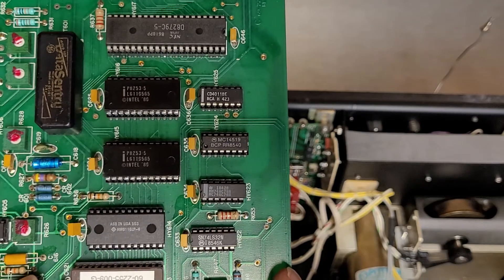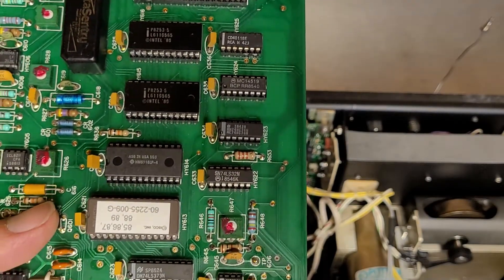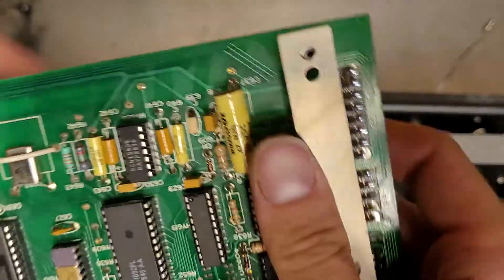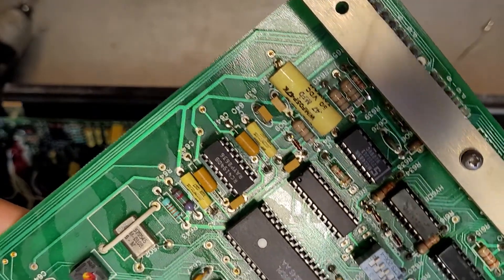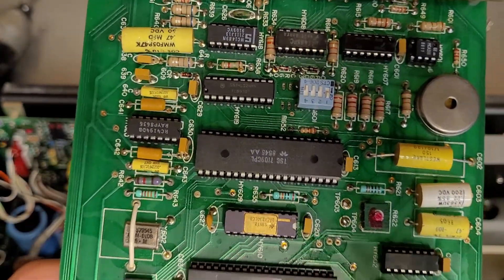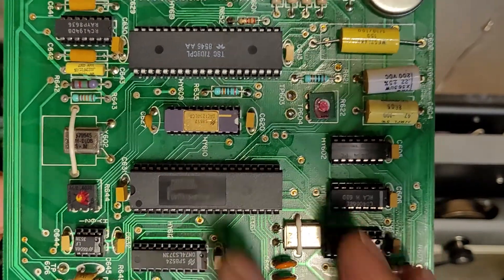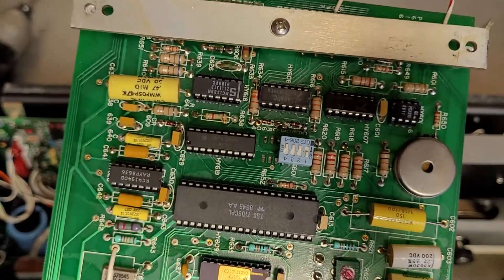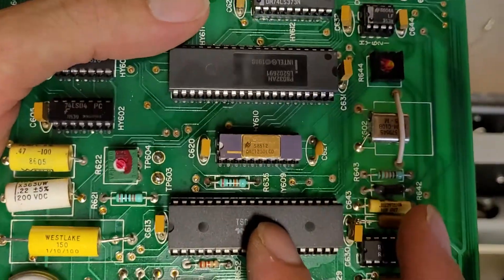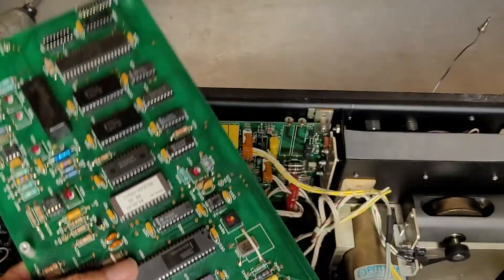I believe that one is a logic chip — 7400 series. P8032AH — a little Intel processor there from 1980. Everything's kind of every which way on this board from a label standpoint. So I'll save this, kind of look at it, and figure out what I want to do.